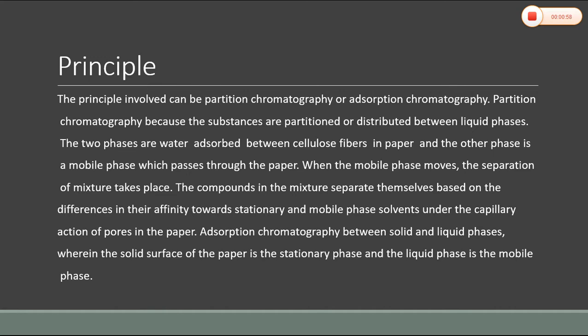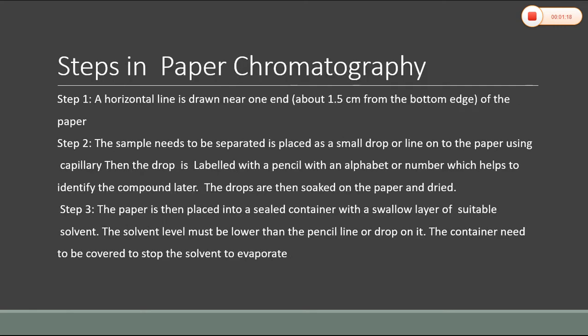When the mobile phase moves, the separation of the mixture takes place. The compounds in the mixture separate themselves depending upon their affinity towards the stationary and mobile phases. In adsorption chromatography, the mobile phase is a solvent, and the stationary phase is the paper surface itself.